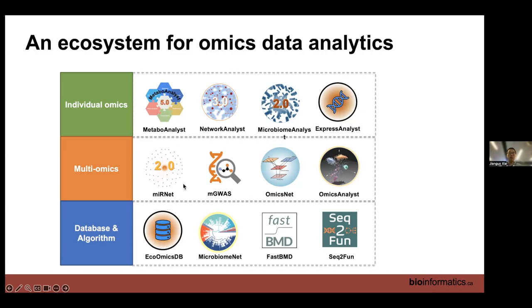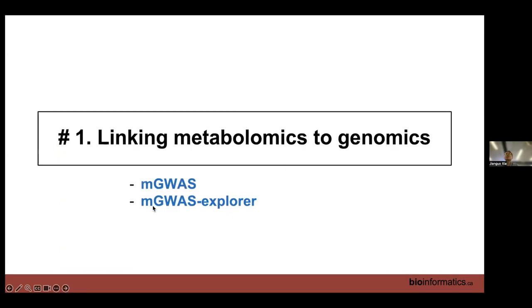A lot of them underlie many of the tools above, because we need to have some annotations and a knowledge base to help the hyperlinking or understanding. So my next topic focuses on how we actually link metabolomics to genomics.